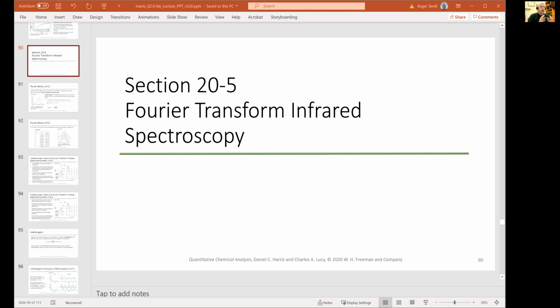And it so happens that with a millimeter per second or so, or maybe a centimeter per second or so of mirror velocity in an interferometer, that takes the mid-infrared frequencies down into the audio spectrum.